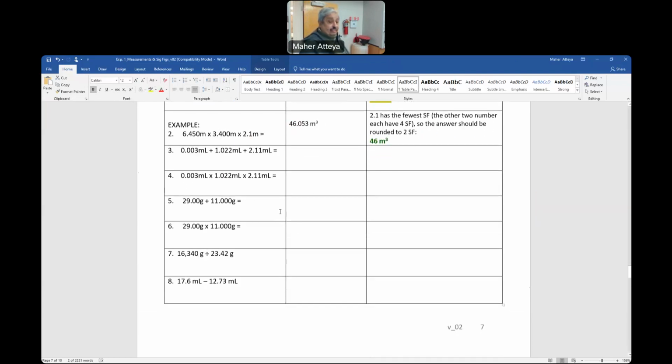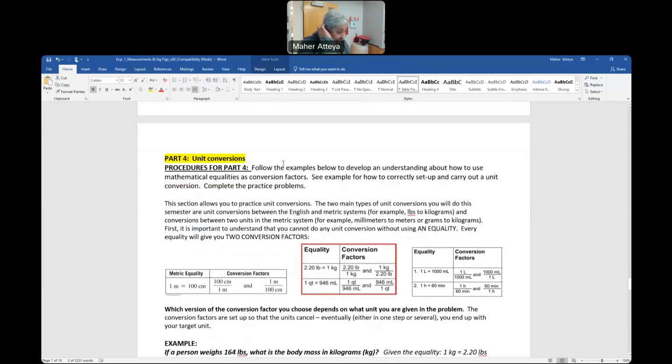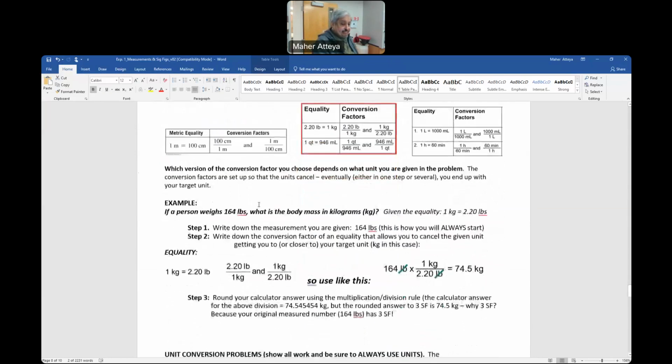And I wanted to fill this one here all the way. We'll have 1 week to finish this lab and submit it as is. So this one here does not have per se. We can do it as a lab report. So I'll show you how to do the lab report. So now the conversion here.